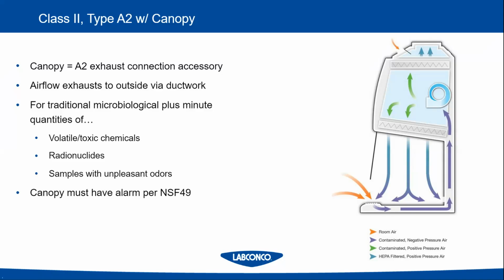So minute is kind of hard to define. Generally, though, this would be things like ethanol, isopropanol, phenol, chloroform, things that are used really commonly in cell biology experiments. And minute amounts, it's again hard to define, and it should be determined in consultation with your EH&S or biosafety officers based on the building's exhaust capabilities. But generally, the volumes used in standard microbiology or cell biology experiments, on the order of milliliters, are generally safe.